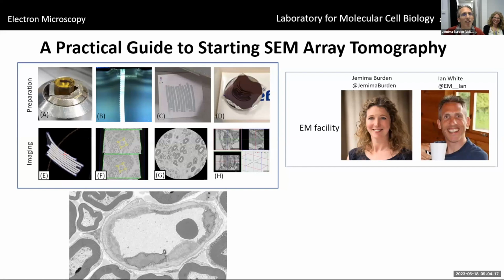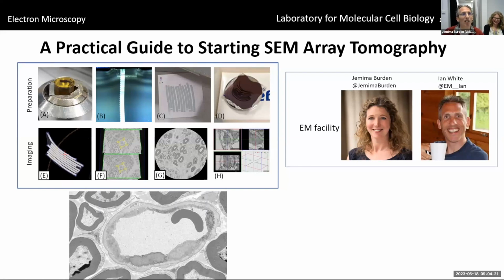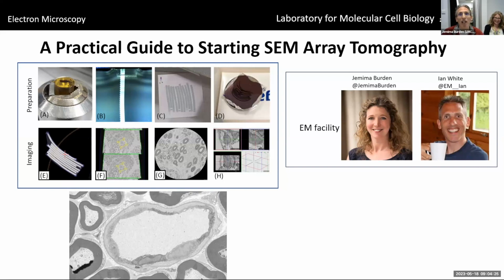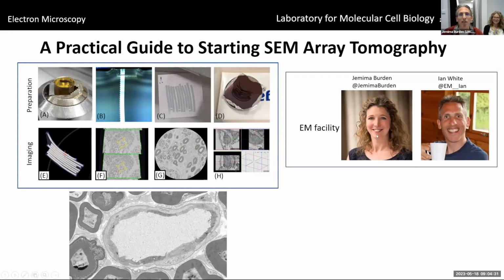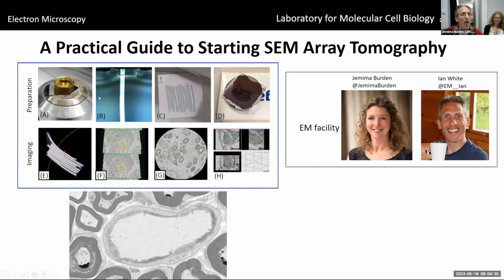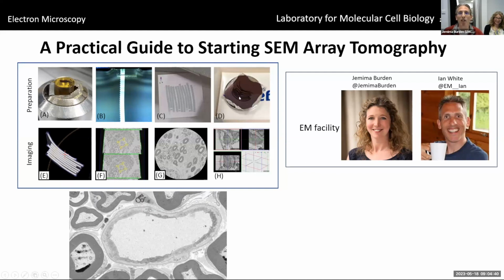We've got the privilege of giving the first of the talks on array tomography today, which is a practical guide to starting SEM array tomography, very much with a focus on practical and starting. I want to say we, that's myself, Ian White, and my colleague Jemima who sat next to me. And I'm going to be taking you through the top row of this workflow from your resin block through to having your sections on substrate ready to go in the microscope.